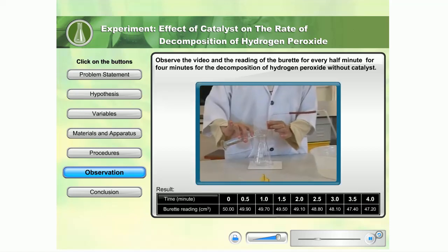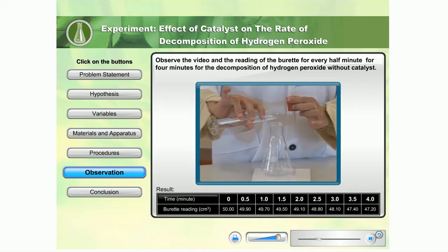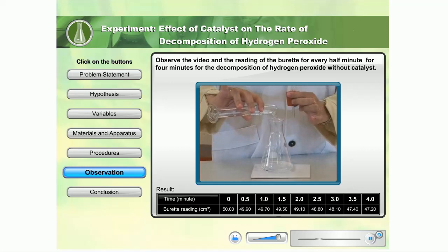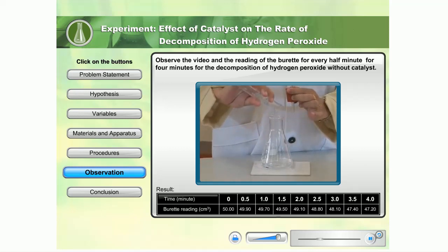Observe the video and the reading of the burette for every half minute for 4 minutes for the decomposition of hydrogen peroxide without catalyst.